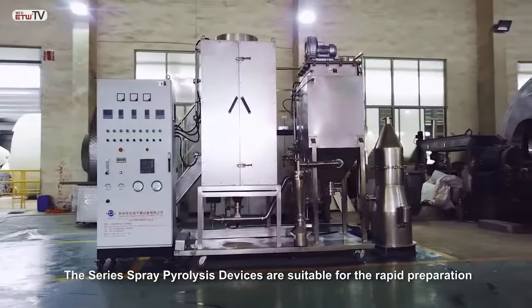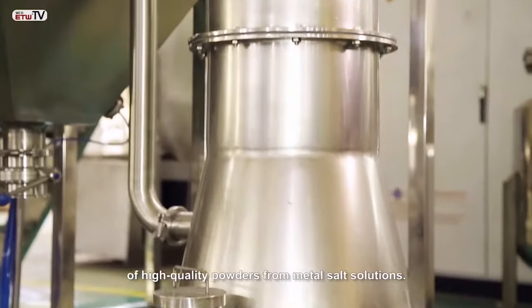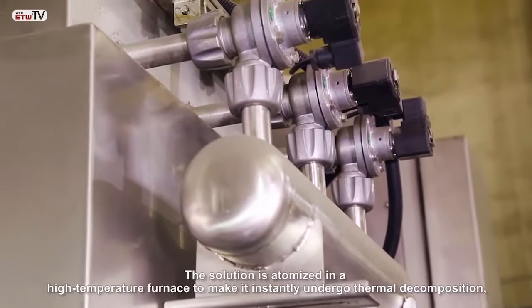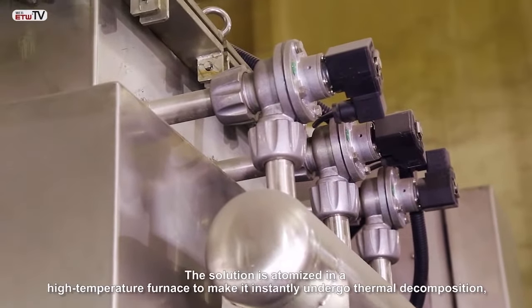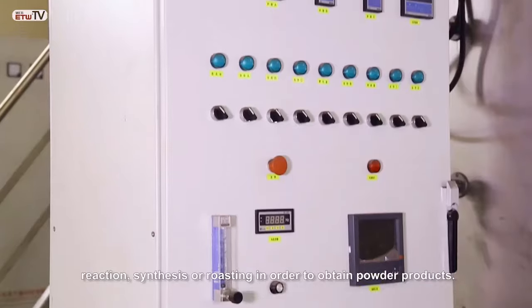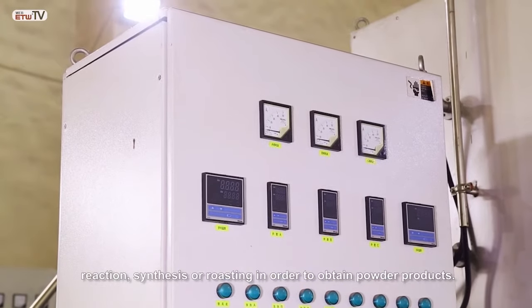The series spray pyrolysis devices are suitable for the rapid preparation of high quality powders from metal salt solutions. The solution is atomized in a high temperature furnace to make it instantly undergo thermal decomposition, reaction, synthesis or roasting in order to obtain powdered product.